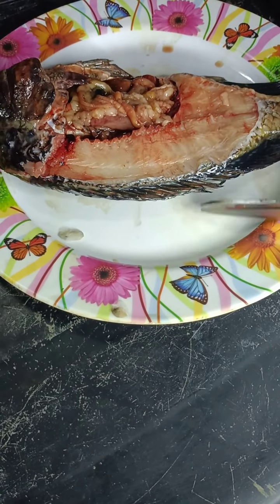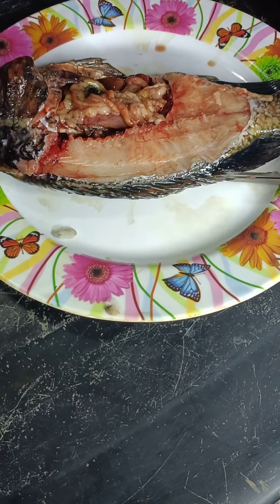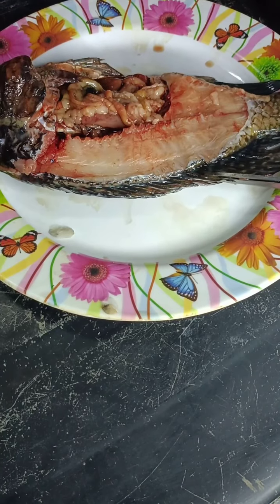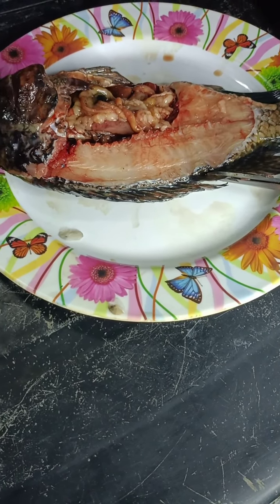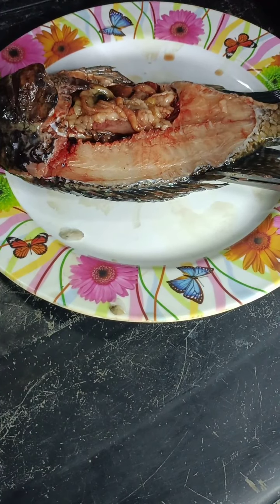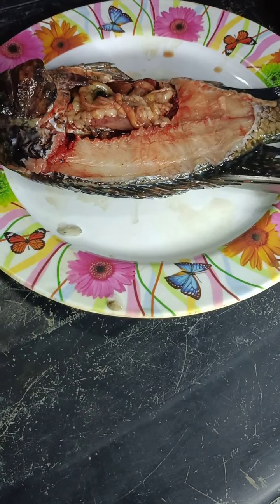Now we have the spine. It is the spine. The spine protects the fish against predators. Such spines have evolved independently in different lineages and are considered evolutionary drivers of fish diversity.